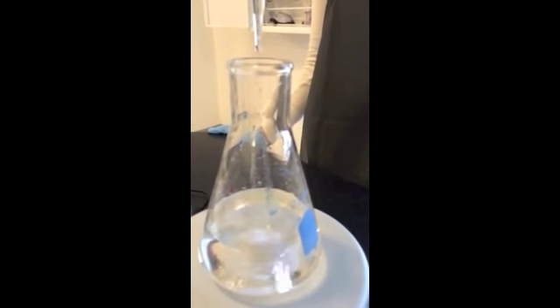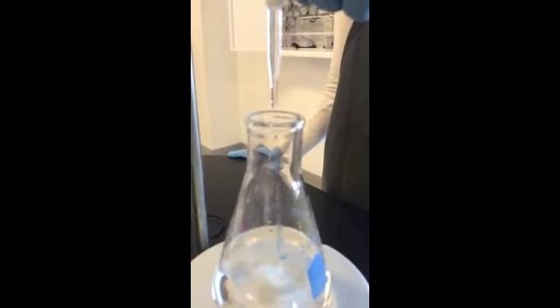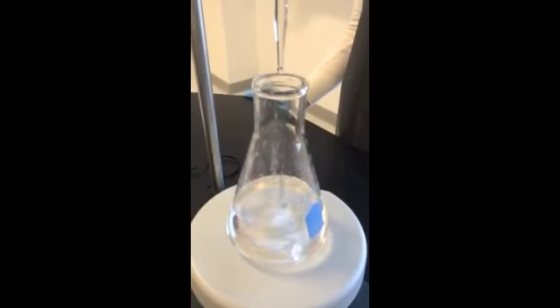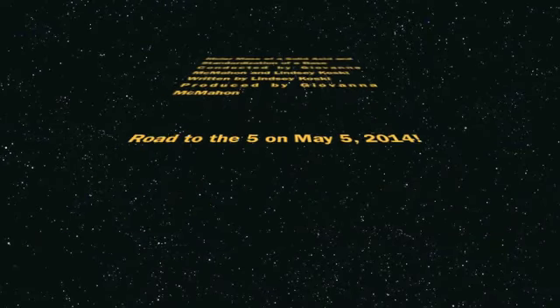Grams of KHP must be converted to moles of sodium hydroxide. Students must also be able to calculate molarity from these calculations. Moles are put over liters of solution. Being able to use stoich to get moles and moles in volume to find molarity is very important. These are primary skills required in calculations. Understanding the significance is very important in understanding acids, bases, and standardization. This skill is used in lab activities very frequently. Using prior skills such as stoich to problem solve is what enables us to use and understand practical applications.